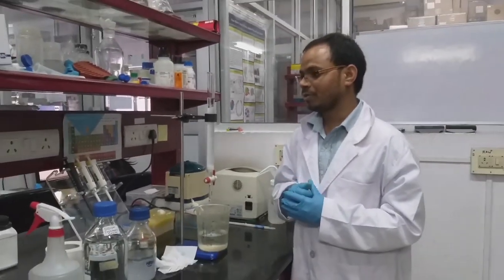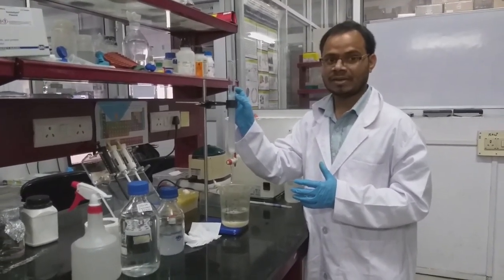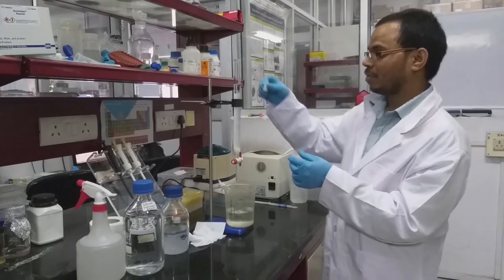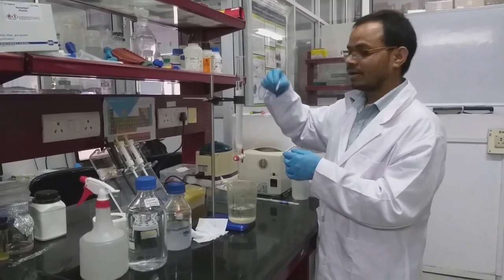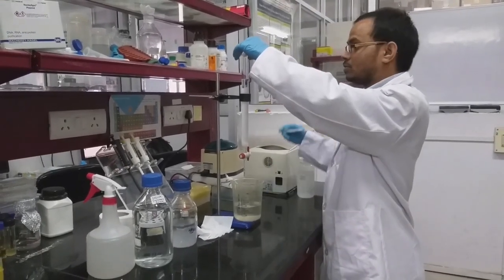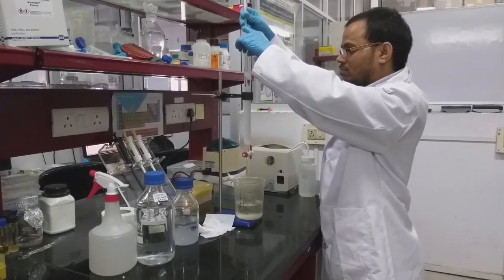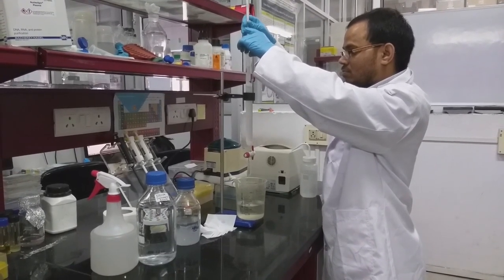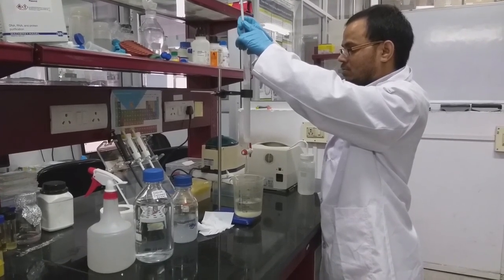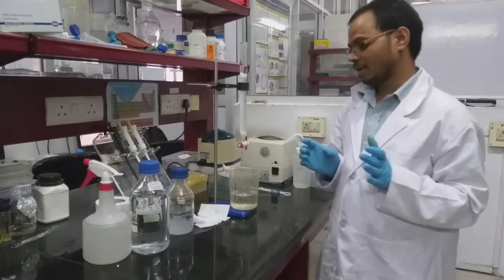Before loading the sample, we have to remember that we cannot directly load the sample as it will disturb the column packing. So what we have to do is put a small piece of paper on top of the beads. On top of that, we can load our sample. So I am going to keep this one. So the next step is we have to load the sample.